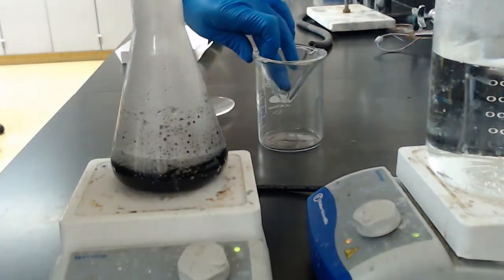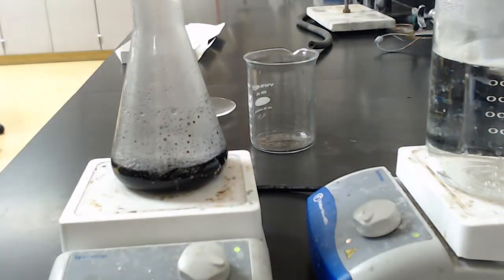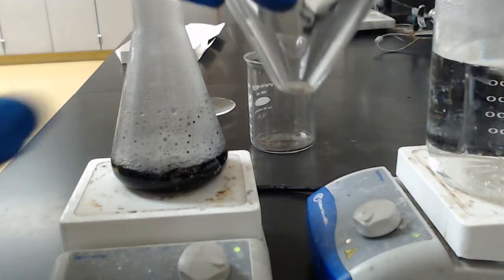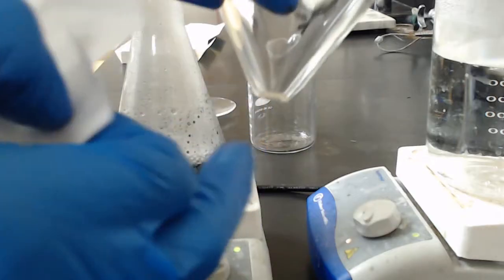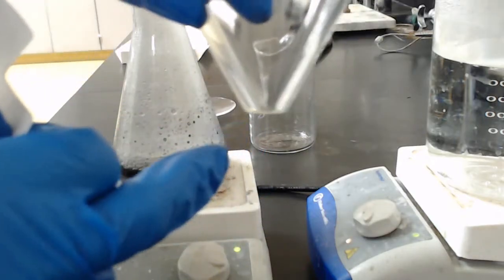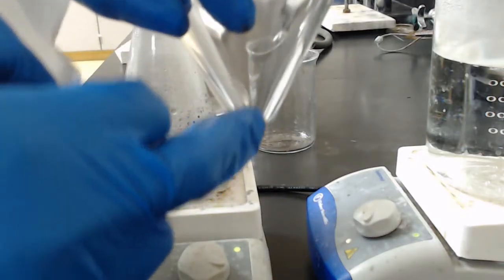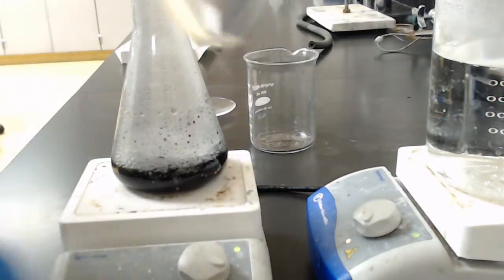All right. And for this type of separation or purification, we want to use a stemless funnel. The reason why is because if you use a stem funnel, what will happen is the acetanilide will crystallize inside the funnel in the stem. So you want a stemless funnel.